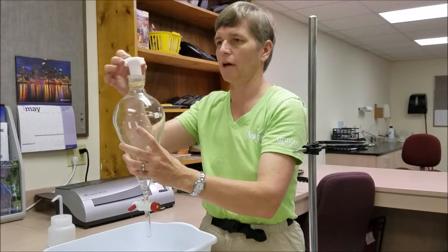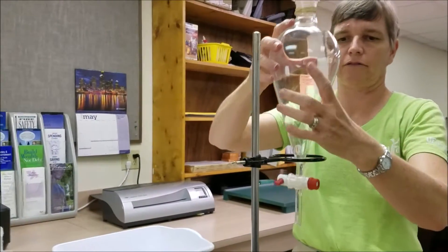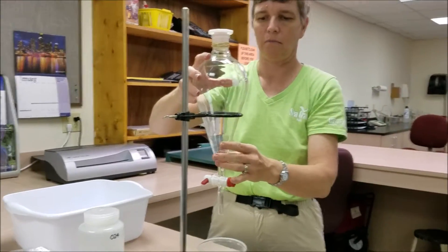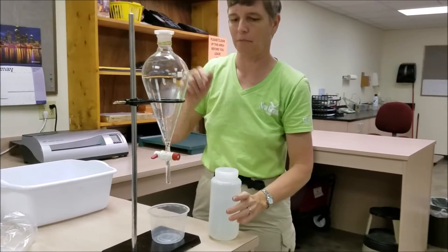We'll close the valve, put the stopper on, and place our separatory funnel back in our ring stand. We're now ready to add our sample.